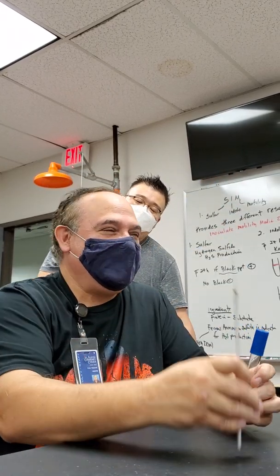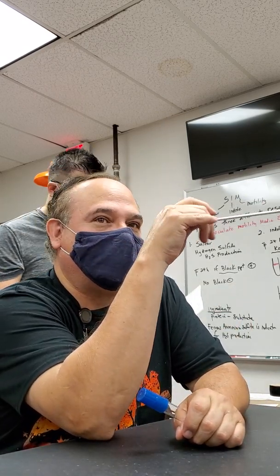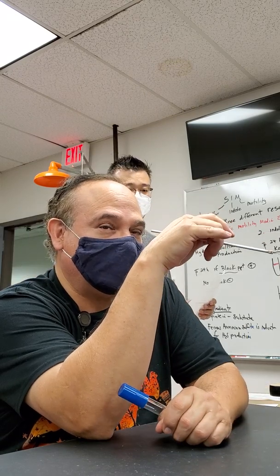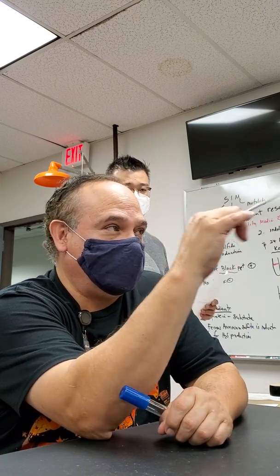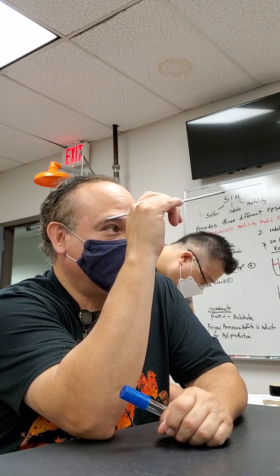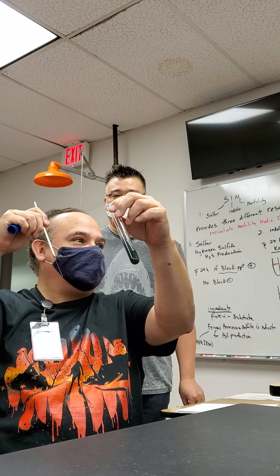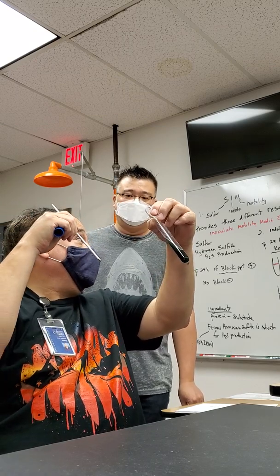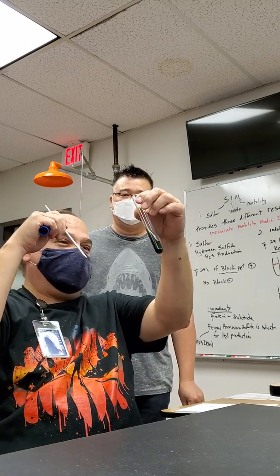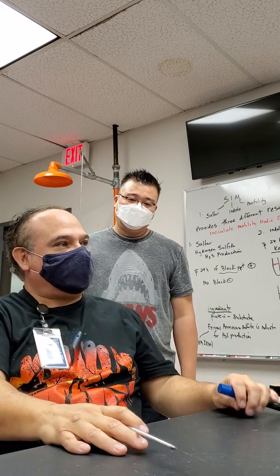All right, so the way you inoculate a slant from now on, if you're looking for a qualitative test, and these are all qualitative tests, is I want you to use a straight needle, and I want you to SSSB. What is that? SSSB stands for, take your bug, come in here, you want to streak the slant and stab the butt. Do not stab anybody else's butt. Okay? One more time. Streak the slant and stab the butt. Anytime you have a slant that you're looking at for a qualitative test.